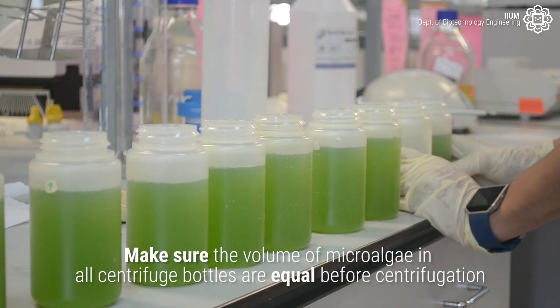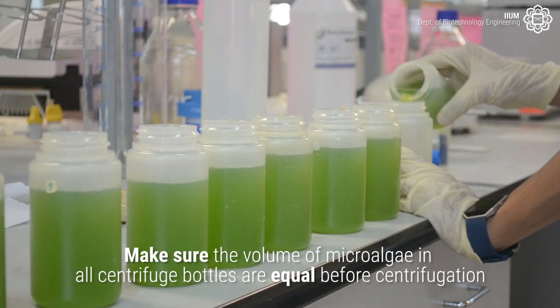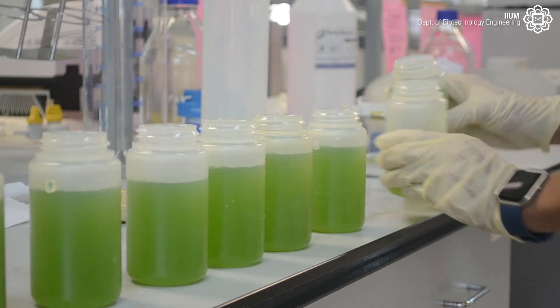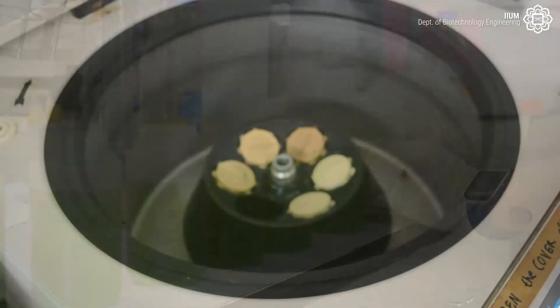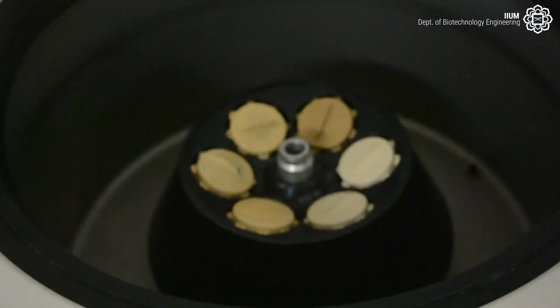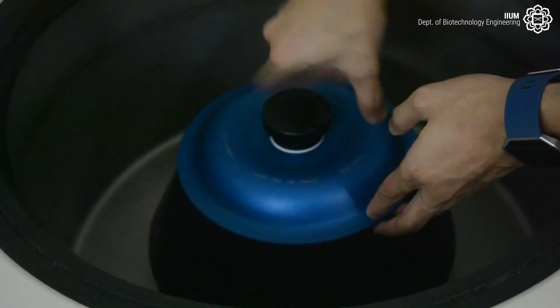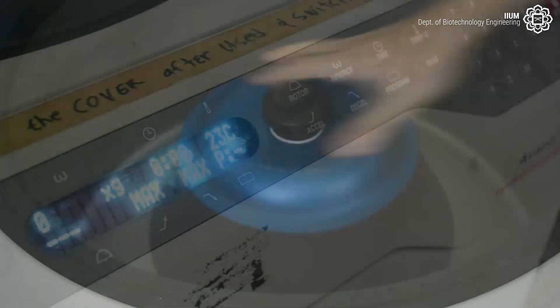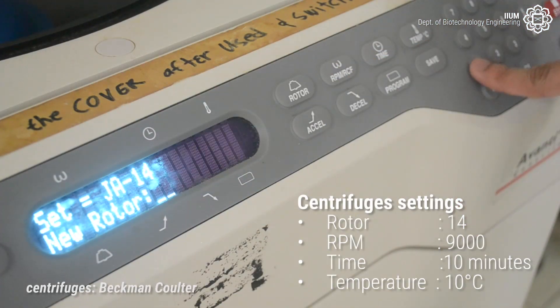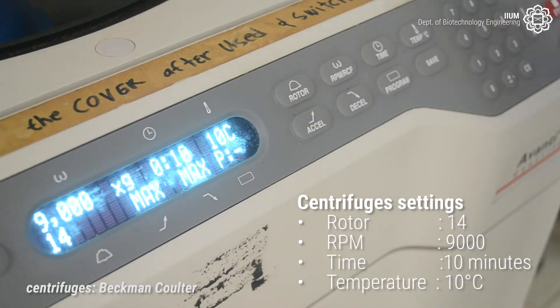Make sure the volume of microalgae in all centrifuge bottles is equal before centrifugation. Place the bottles inside the centrifuges. Set the centrifuges as follows: rotor 14, RPM 9000, time 10 minutes, and temperature 10 degrees Celsius.